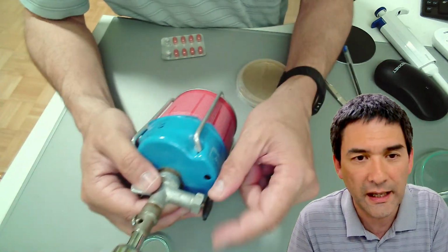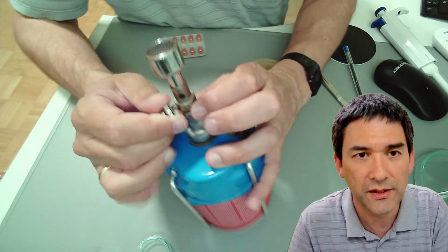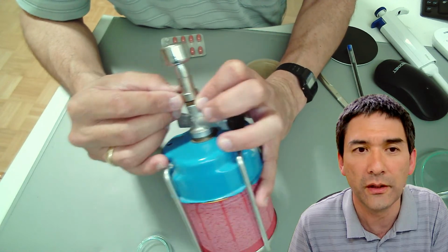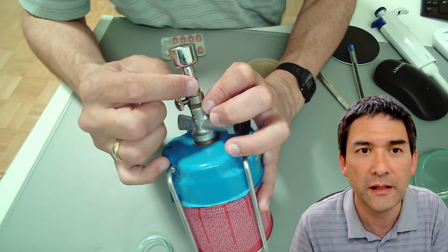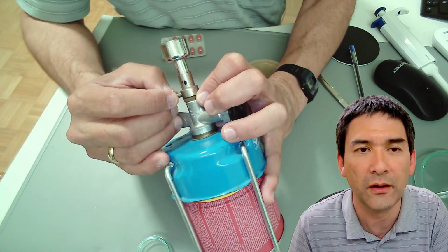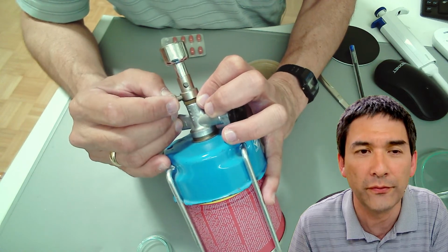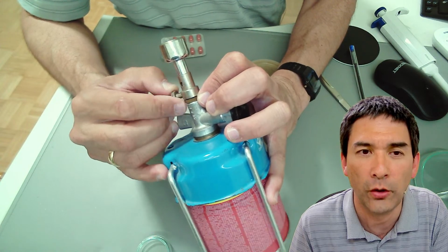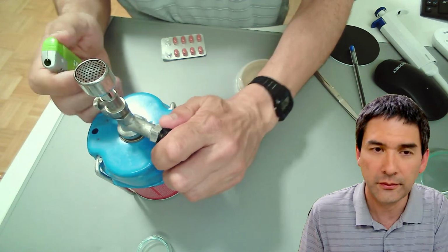This here is for the gas. And over here, this one is the air supply. You're able to turn this, and then the hole is closed. And now there is a lot of air able to enter, and you see that the hole is open, and now it's closed again. This is pretty important for adjusting the right amount of air. And for lighting it, I usually cut the air supply off a little bit. And when I light it, I have to turn it on.